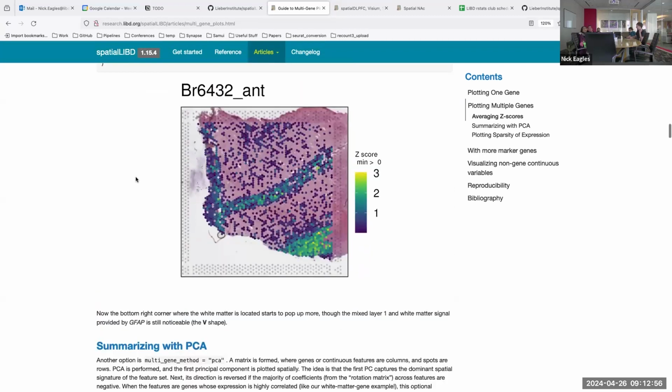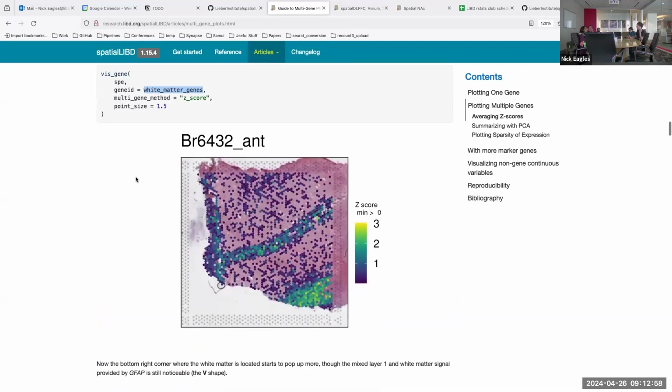What if it's missing, like you don't have any gene expression for a point? If it's NA, it just drops the NAs. So you just average the other 3. It would just ignore any NAs, so if it's just a couple, it'll be fine.